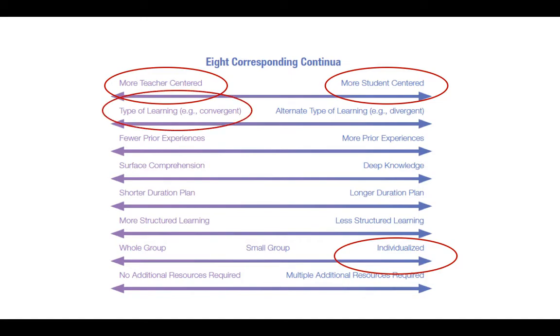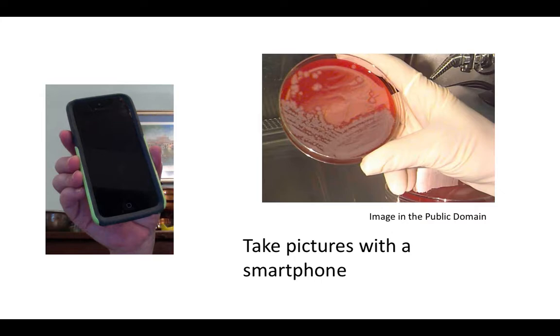Since plates cannot be removed from the lab for safety reasons, we want an activity that will record the students' results. A photo record of their results will allow them to compare what they see with the results their peers have obtained and with their own voice notes on how the procedure went for them, as well as with the feedback they get from their instructor.